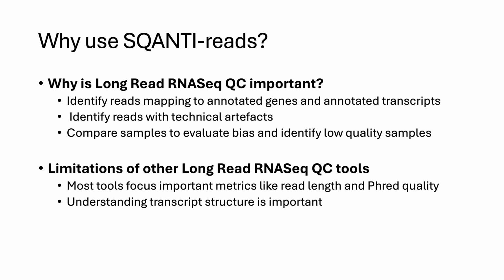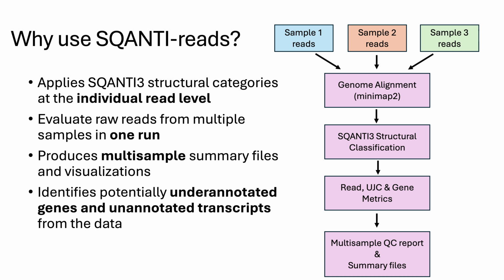But the existing QC tools for long-read RNA-Seq have limitations. Most focus on basic metrics like read length and read quality. What they don't capture is transcript structure, and that's really important for understanding long-read RNA-Seq data. So now that we know why QC is important, let's look at what makes SQANTI-reads different and useful.